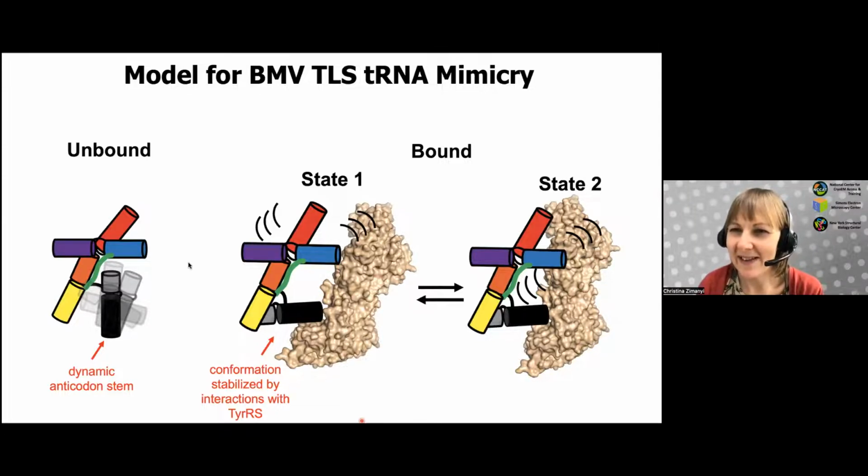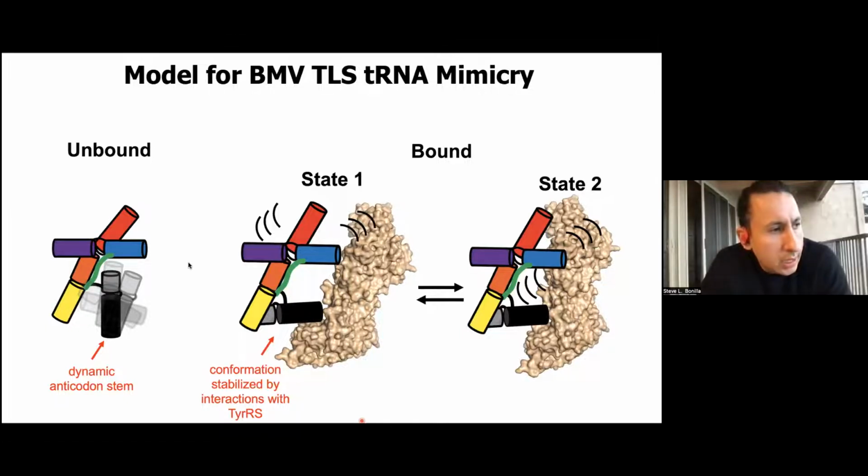Minwoo Sung asked, for the 3D variability analysis, were you able to find which motions are most significant from principal component analysis? I assume there are some random motions captured from the variability analysis as well. So that variability analysis allows you to choose how many components you solve.